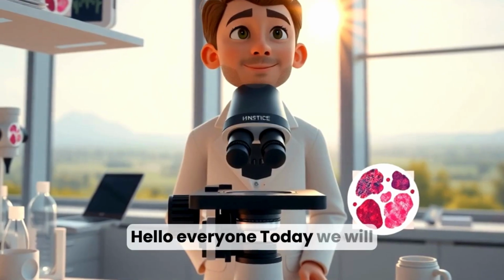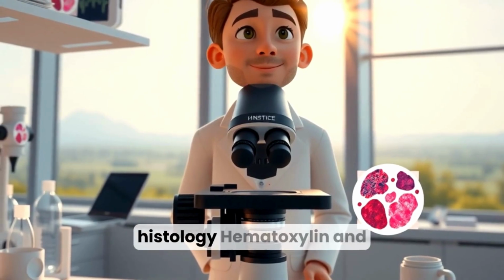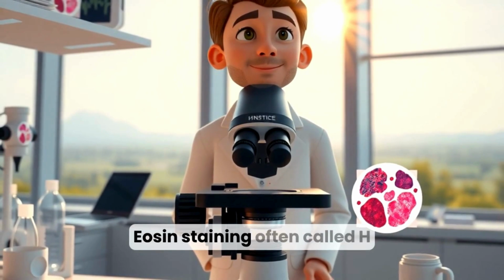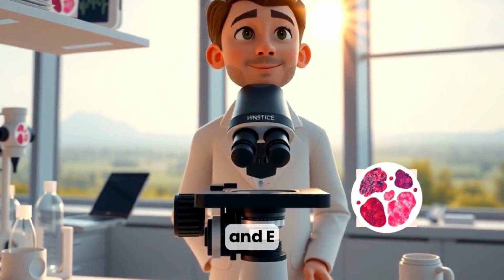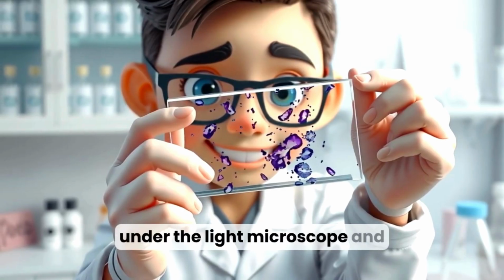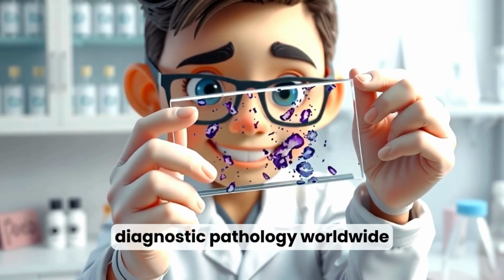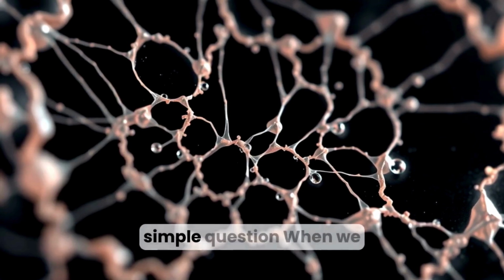Hello everyone, today we will explore one of the most fundamental techniques in histology, hematoxylin and eosin staining, often called H&E. This method is essential for visualizing tissue structure under the light microscope and is used in research and diagnostic pathology worldwide. Let us start by asking a simple question.